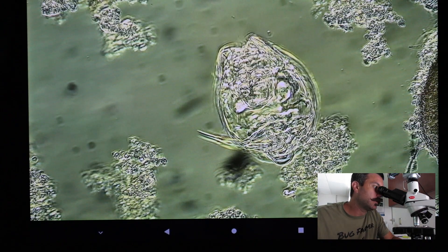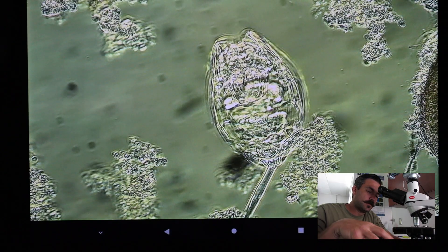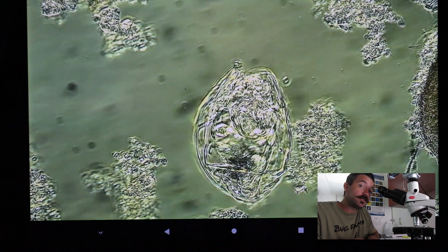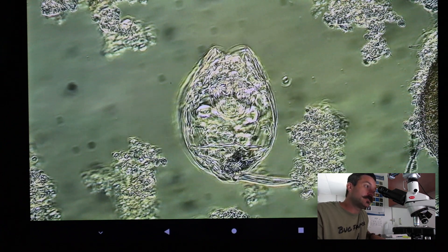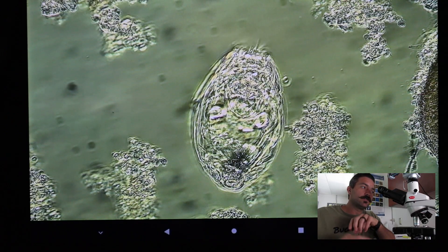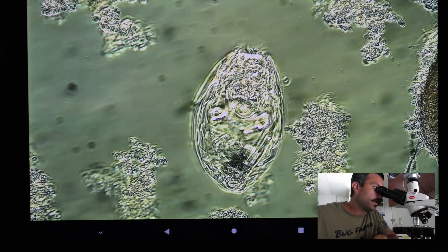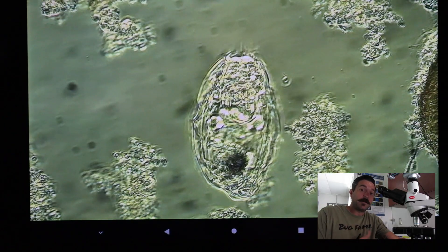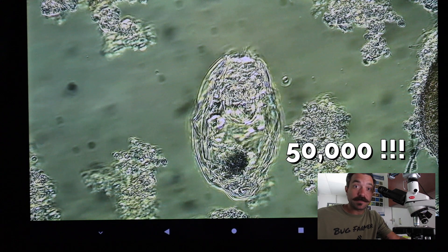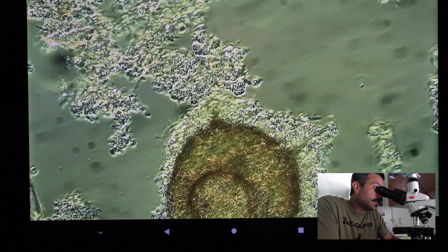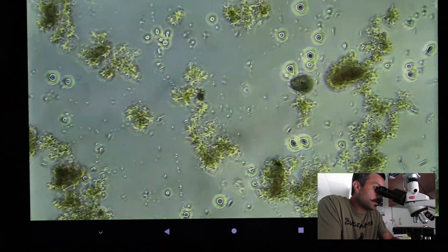You want to see a diverse population. You don't want your slide full of rotifers. The predominance of your bugs should be crawling ciliates and stalked ciliates - that's what you want. You don't want them overly young with amoebas and flagellates, and for the same reason you don't want it too old with all rotifers or all bristle worms - those are not good indicators. Predominance is key and you want a diverse population.